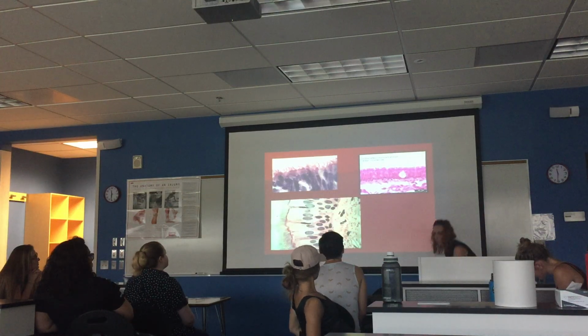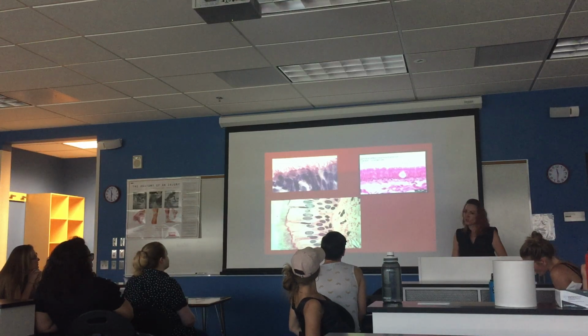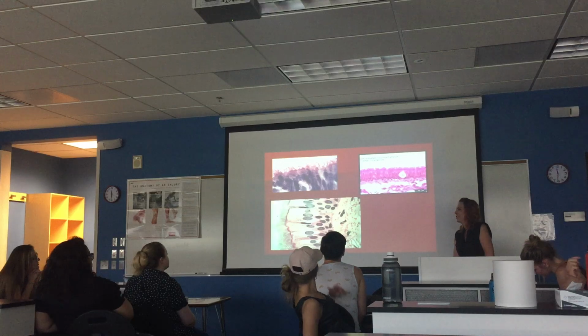So you'll be waiting here. Right? So 3 different versions of ciliated pseudostratified columnar epithelial.